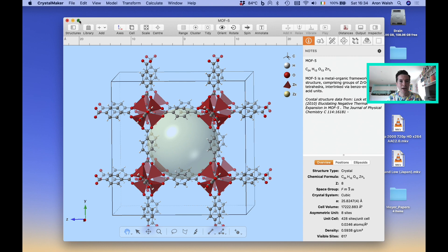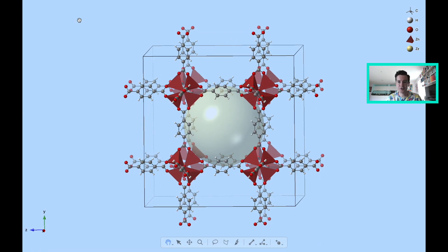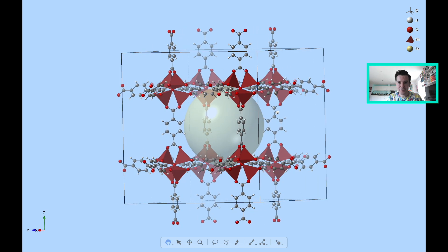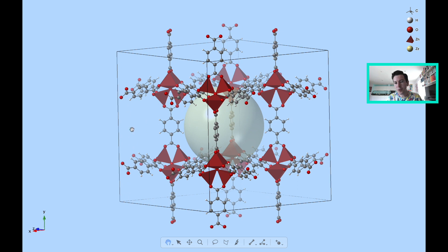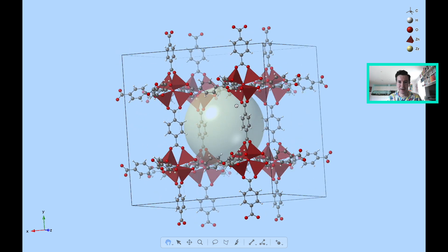Here is the crystal structure of MOF-5. This is one of the prototype metal-organic frameworks, synthesized and characterized by the group of Omar Yagi, who's now at UC Berkeley. You can see it's a very interesting structure. You have one building block based on benzene with two carboxylates, and then another building block based on these tetrahedra of zinc oxide, and you can see they're all connected in quite a special way.